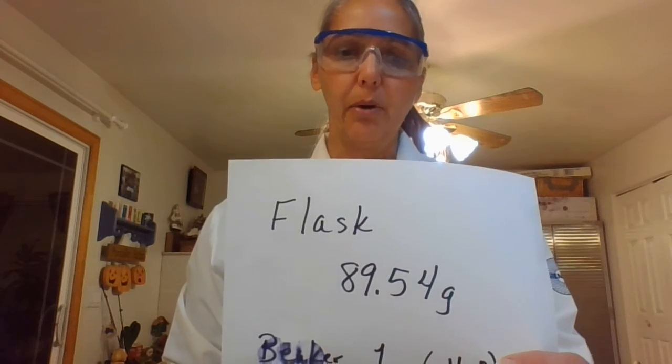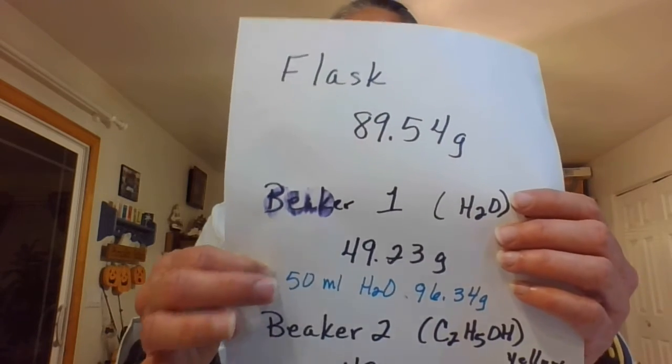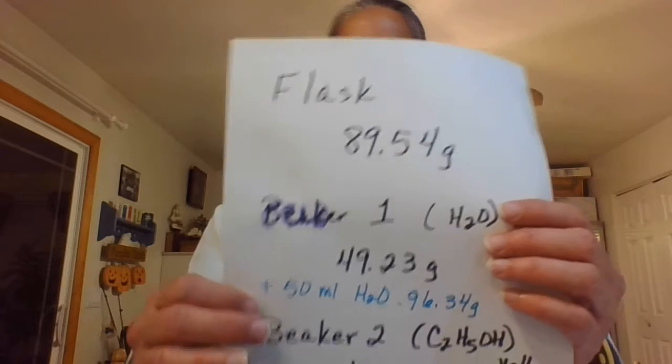Okay, so we're going to get the volume here in just a minute, but first I'm going to get the mass. Remember, this flask started out as 89.54, and I added some water and some alcohol. So figure out how much water and alcohol I added for the mass. Then I'm going to take the stopper off.